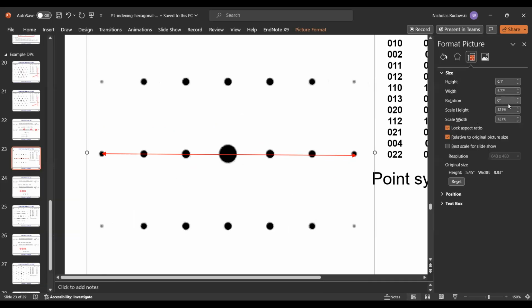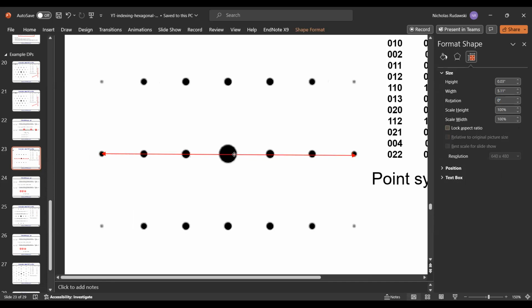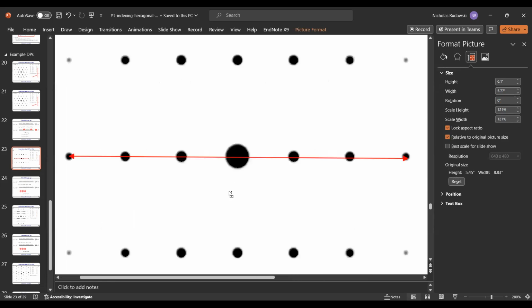More rotation options. Rotation. Is that 1 degree? Or is that too much? Well, let me do half a degree. No, it won't. Okay. We'll just have to go with it here. Unfortunately this is not perfectly flat, but we'll go with it anyway.